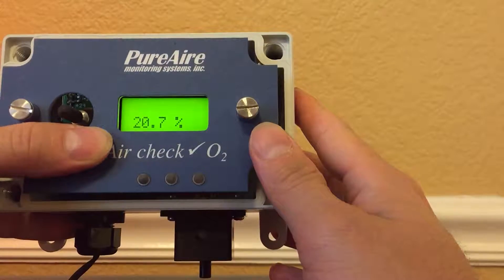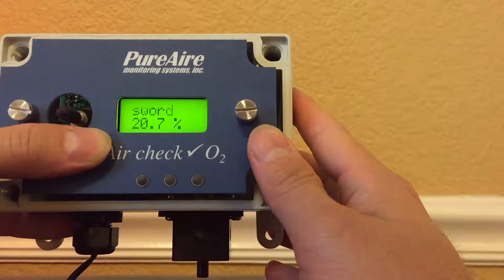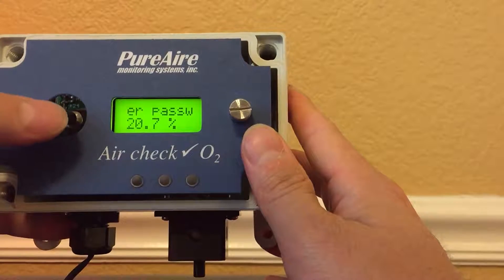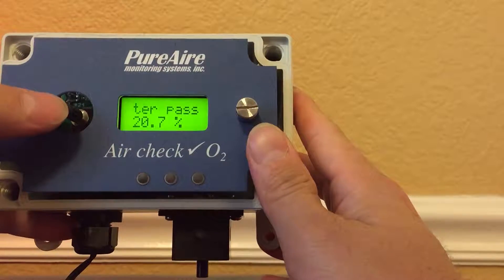In today's tutorial we're going to get into the menu and adjust the sensor reading. As you can see it's reading twenty point seven — we're going to adjust it to twenty-one percent. It says 'enter password.'